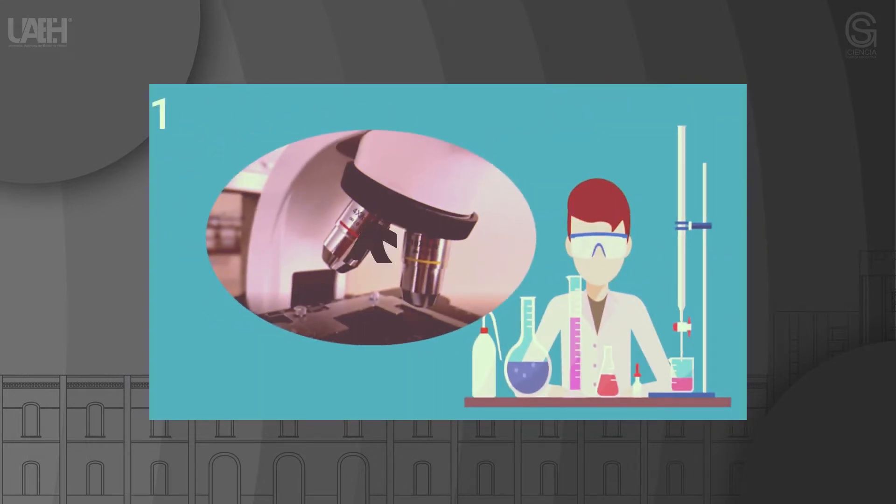Step 1: Using the nosepiece of the microscope, position the objective with the lowest magnification. The observation always starts with minimum magnification, from which it is increased until reaching the desired magnification level.